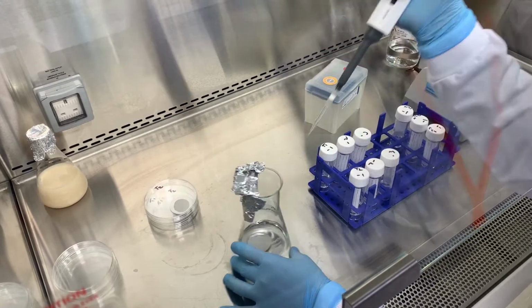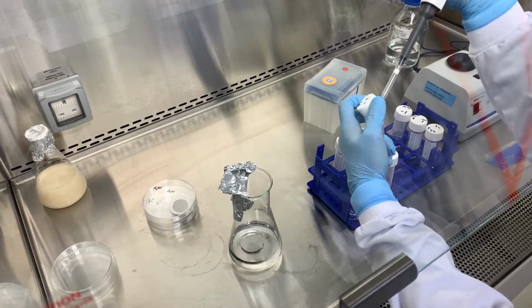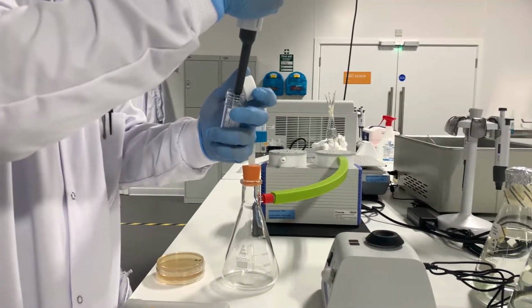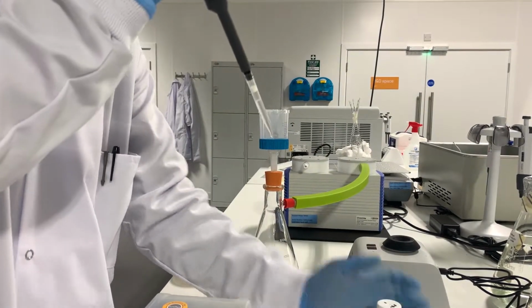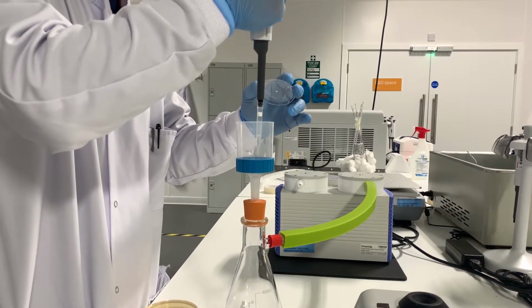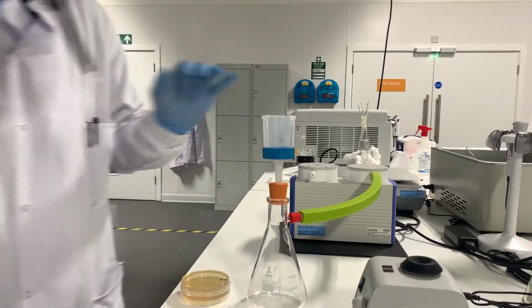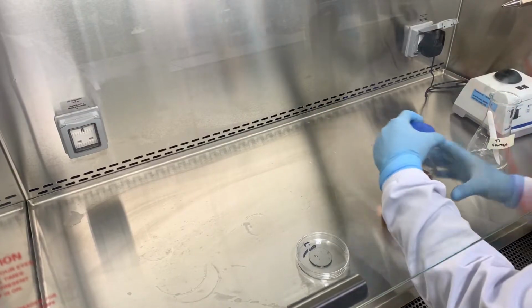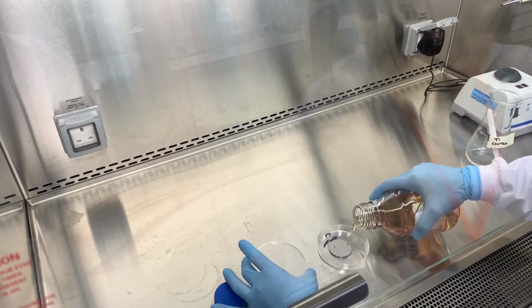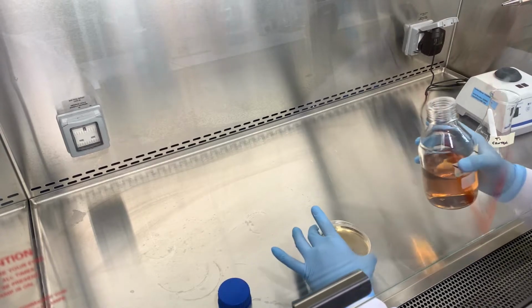The next step is to perform serial 10-fold dilution of the recovering medium containing the carriers, followed by duplicate 1 ml pour plate technique using appropriate agar medium such as tryptone soya agar for each dilution. The remaining liquid is then screened for any surviving organism by using a membrane filtration system. Finally, the stainless steel carriers are placed with the inoculum facing up onto an empty petri dish and molten agar medium poured over it.